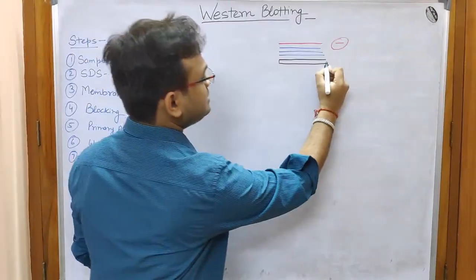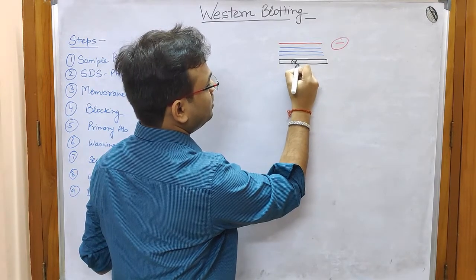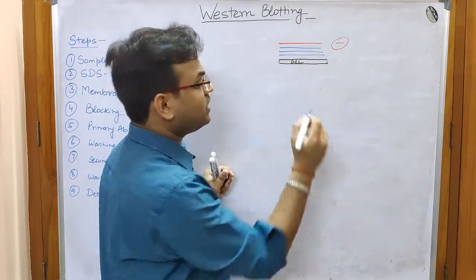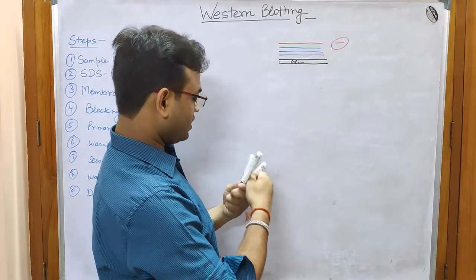Okay, so this is the gel. Remember, this is the gel. I am also writing it over here: this is the gel. Now you have to keep the PVDF membrane in contact with this gel. Okay, let me draw it with a different color.